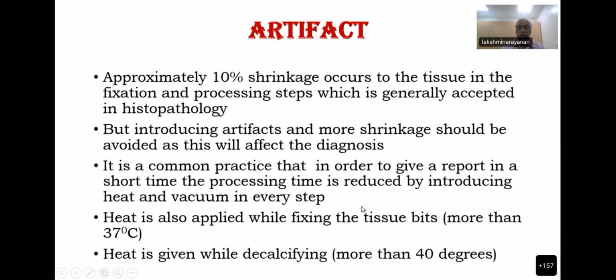But introducing artifacts and more shrinkage should be avoided as this will affect the diagnosis, which Dr. Praveen has stressed in his slides. And why we are telling this is, it is a very common practice nowadays in the market to give the report very early. Today the specimen comes, tomorrow the report should be ready.